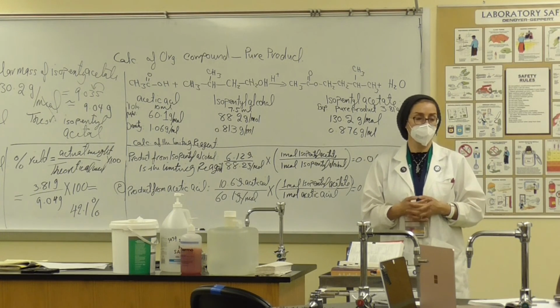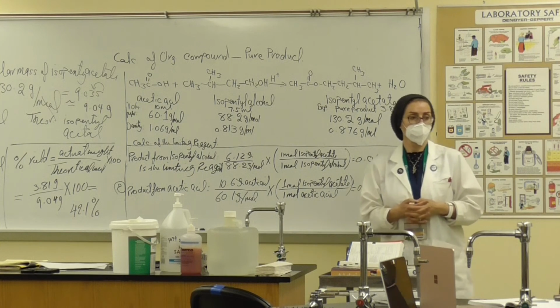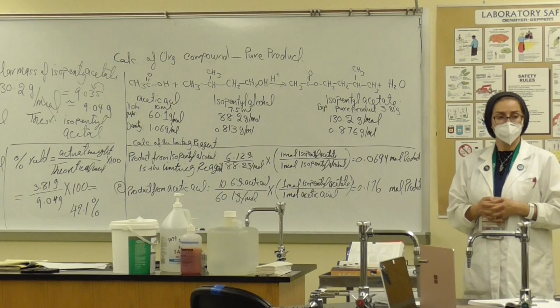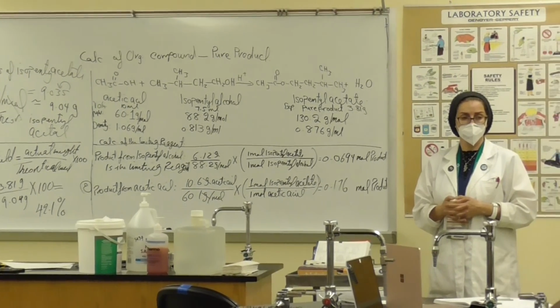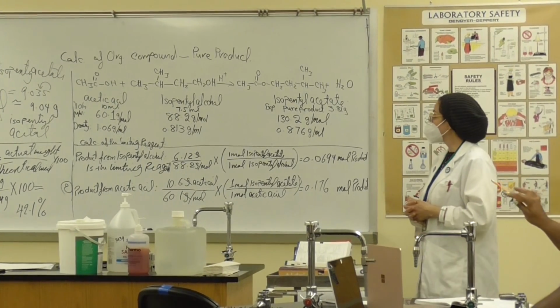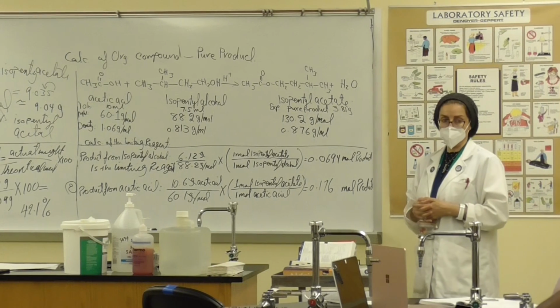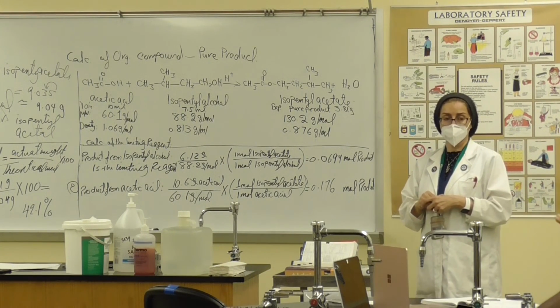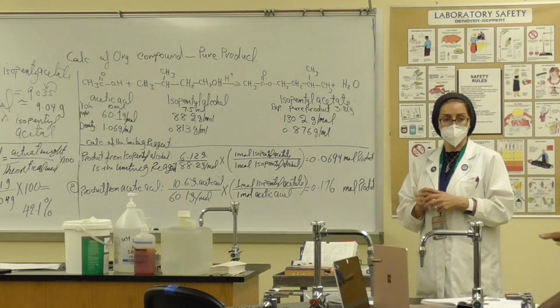Yes. I know you repeated it multiple times, but I want to make sure that it sticks in my head, because when I see a problem like that, I want to be able to solve it. We are taking those two, acetic acid and isopentyl alcohol, and we're going to mix them together so we can get the product that is isopentyl acetate. Right. Those are the steps to make them.